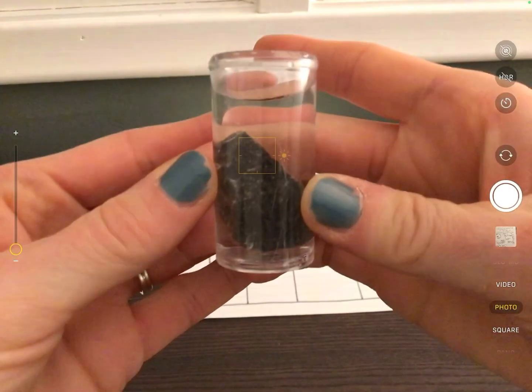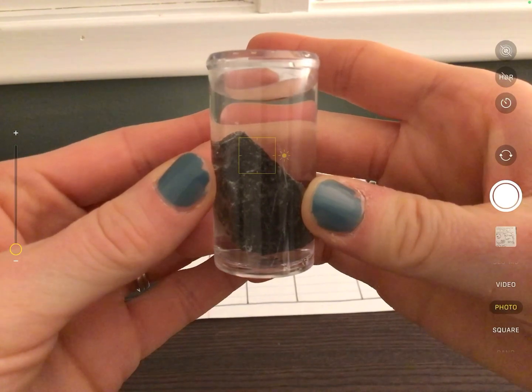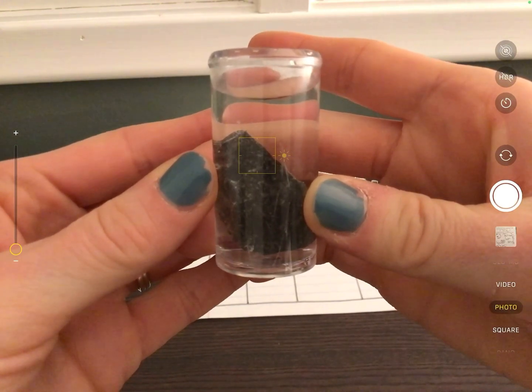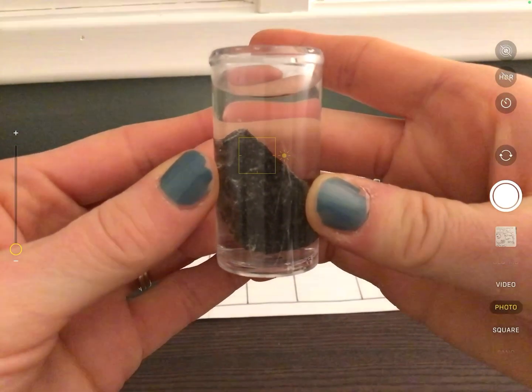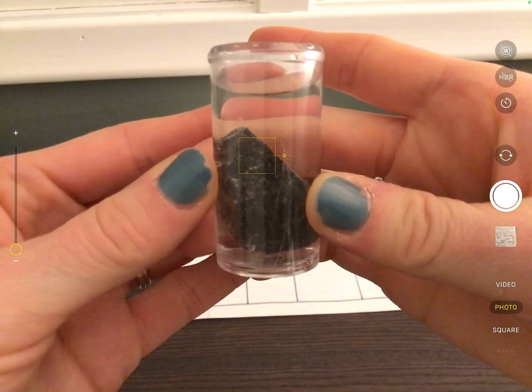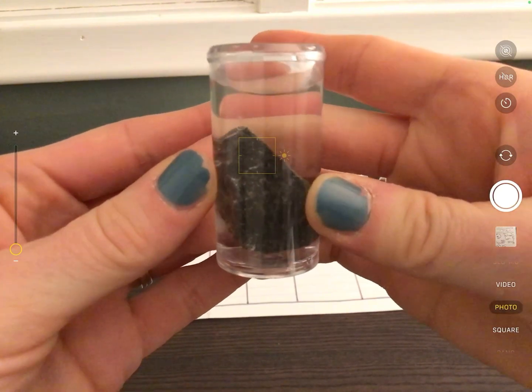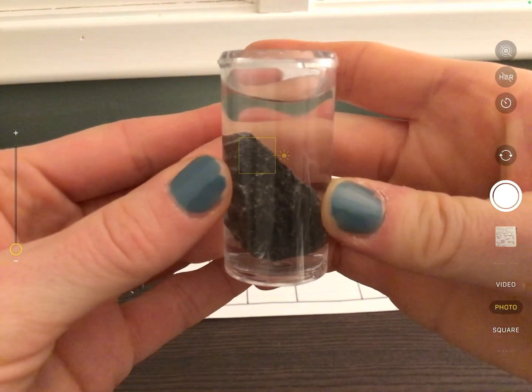Now, if you look at this even closer, what do you notice about what has happened with the bubbles? Are they still coming off of the rock? I see just a couple on the left-hand side, but it looks to me like most of the bubbles have stopped.